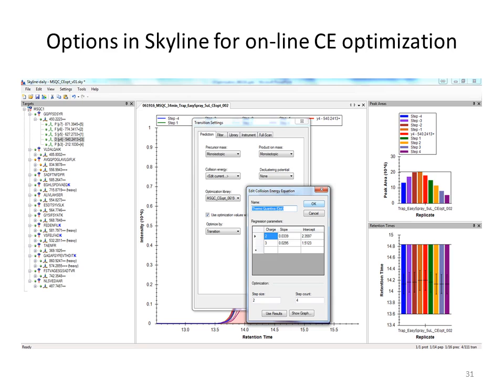So if you go into Skyline under transition settings, and then you'll see this window, and you click, it shouldn't really matter, edit current, whatever the one that it's on. You should see something like this, and this is showing for each charge of your peptide, there's a slope and a y-intercept, and that's the regression plot that's set up for whatever instrument you just edited current.